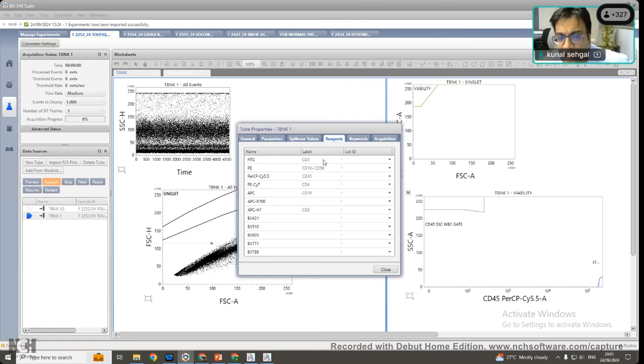In this machine, like I have shown, I have 12 channels. So my machine is a 12 color instrument where I can put 12 different fluorochromes which emit different colors. Currently, I am using only 6 color in this test. Okay. Anybody can tell me why is this called multi-parametric? Is there any difference between color and parameter?